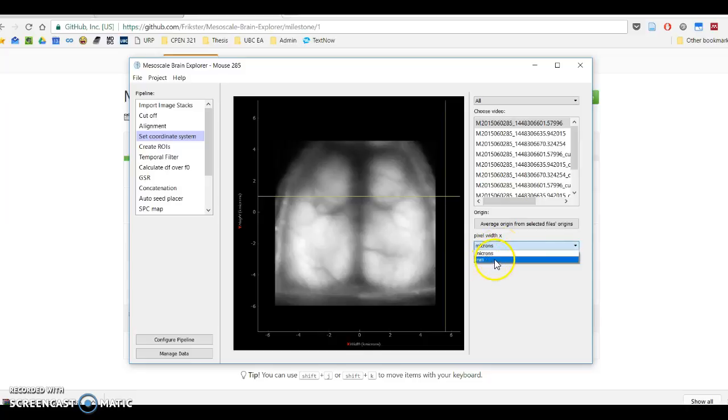The purpose of this selection tool over here isn't just to change the X and Y coordinates. In the future, you should be able to use this where you, for instance, pick microns here and set your pixel width in microns, but say the coordinates that you're importing are for particular brain regions, and that's in centimeters or millimeters. Then it's nice to just quickly be able to import in millimeters, but have this in microns, and the application will, in the background, work out how the conversion happens.